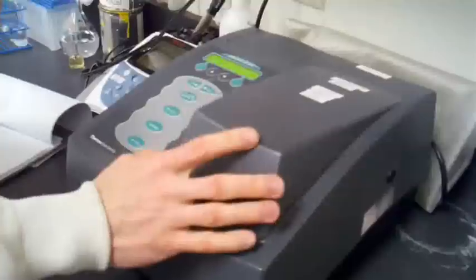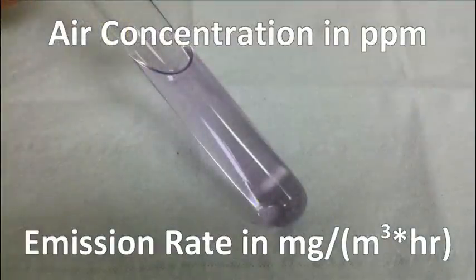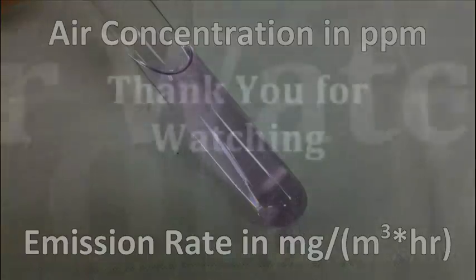The results of this test method are expressed as the formaldehyde concentration in air in parts per million, or ppm. It should be noted that these results are only relevant to the specific air exchange rate and loading ratio used and that the small chamber results may differ from those expected in the full-scale indoor environment.